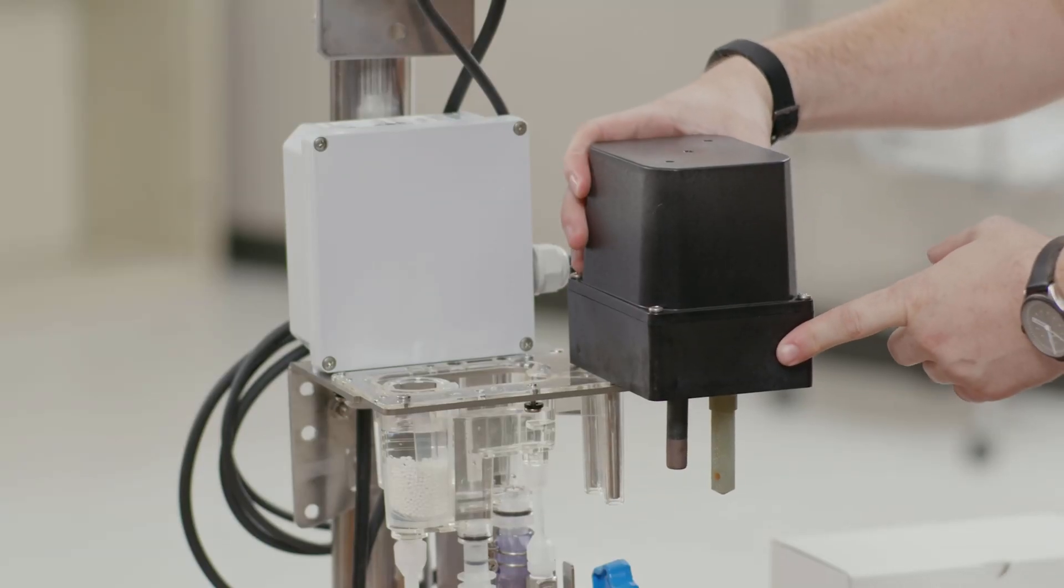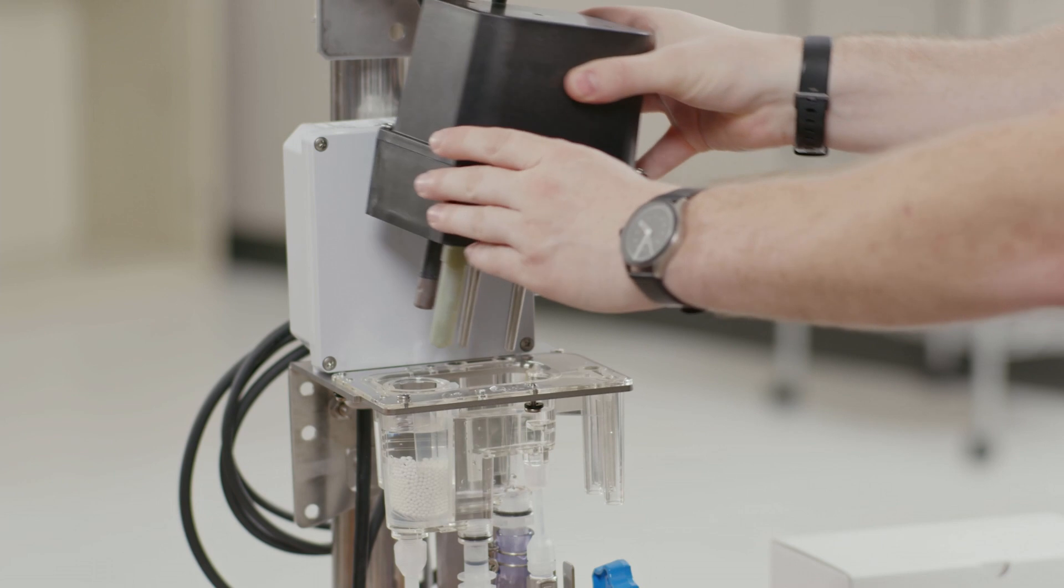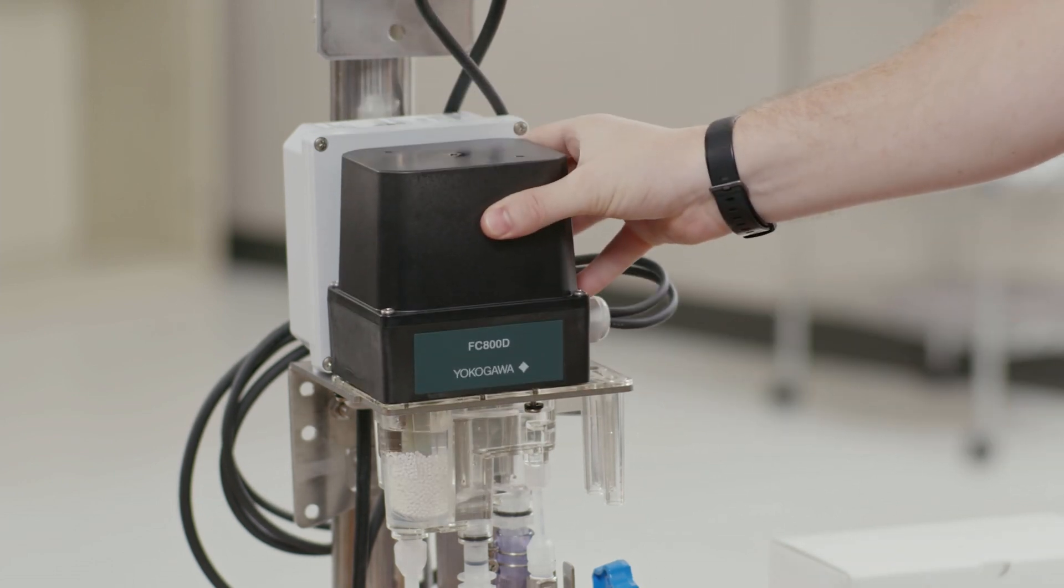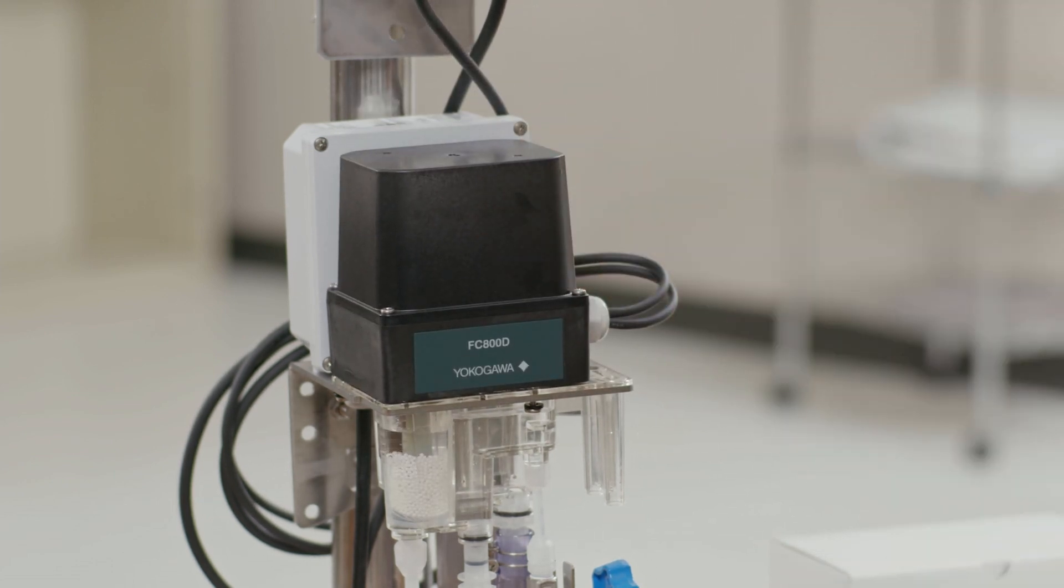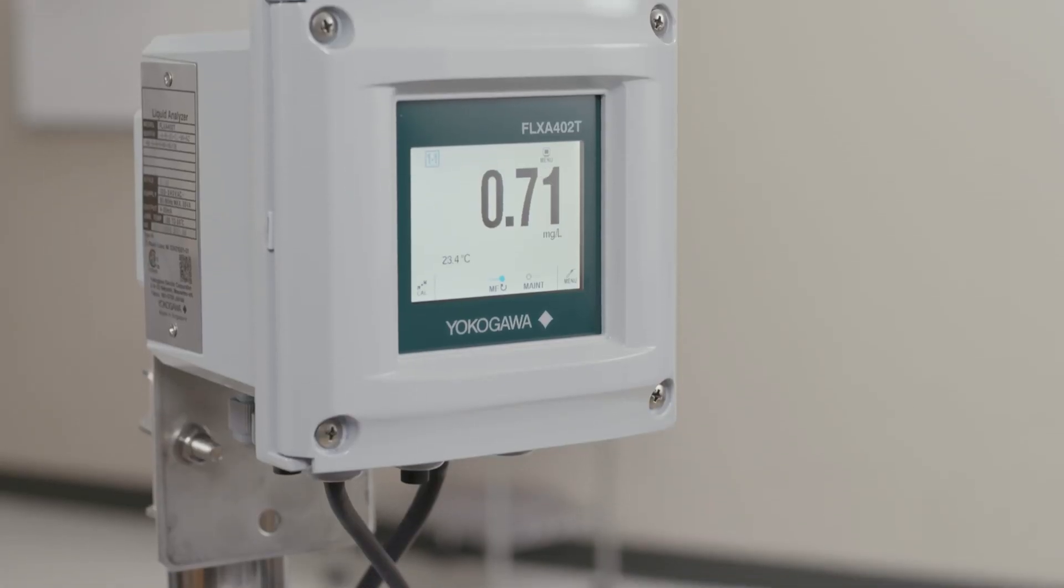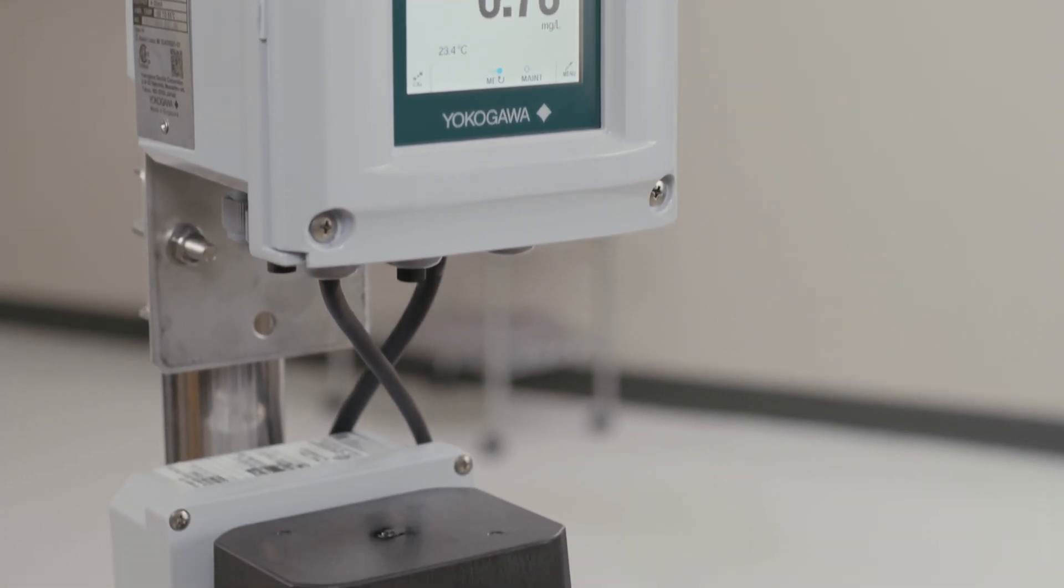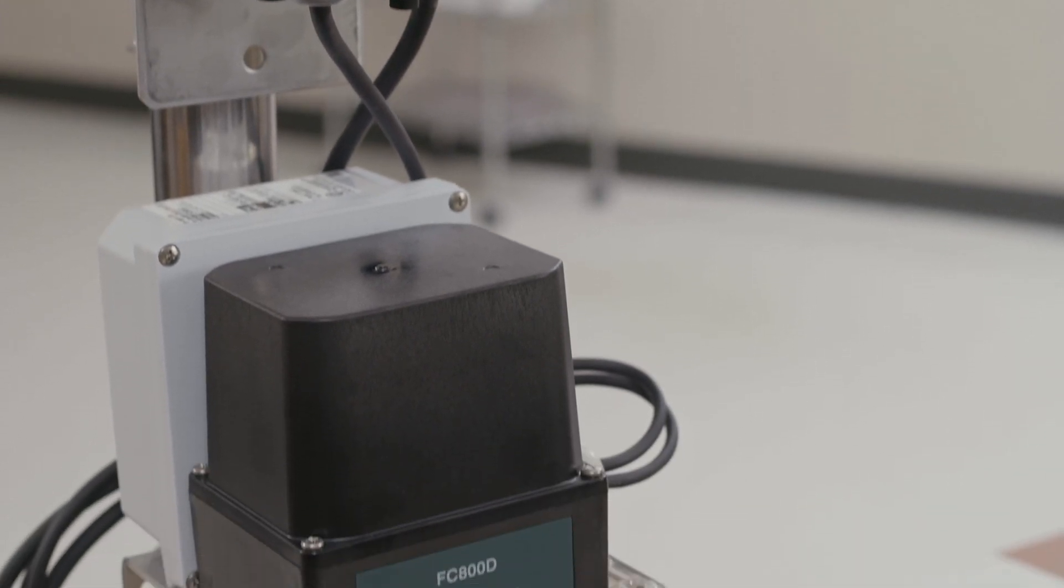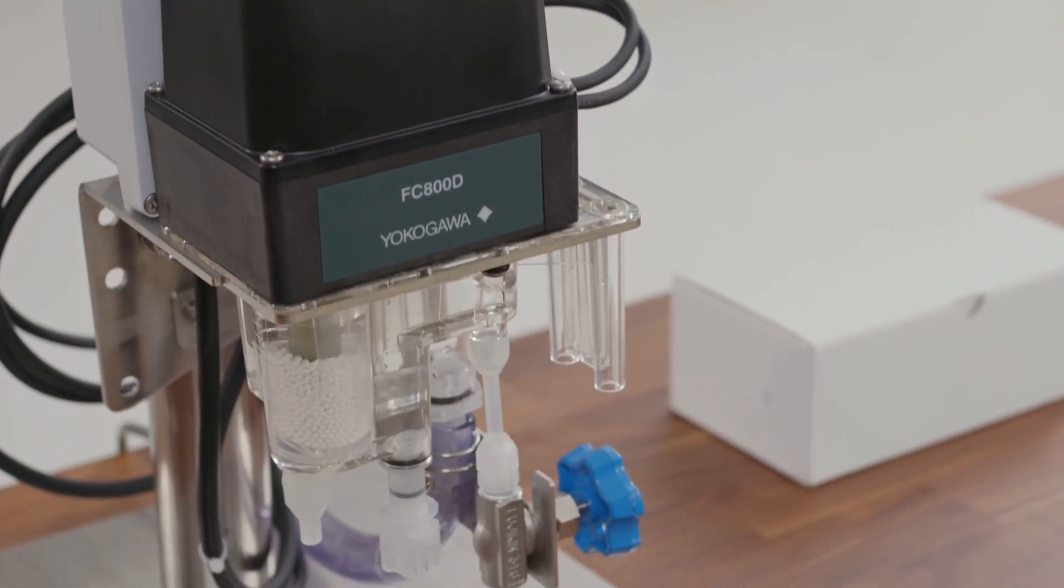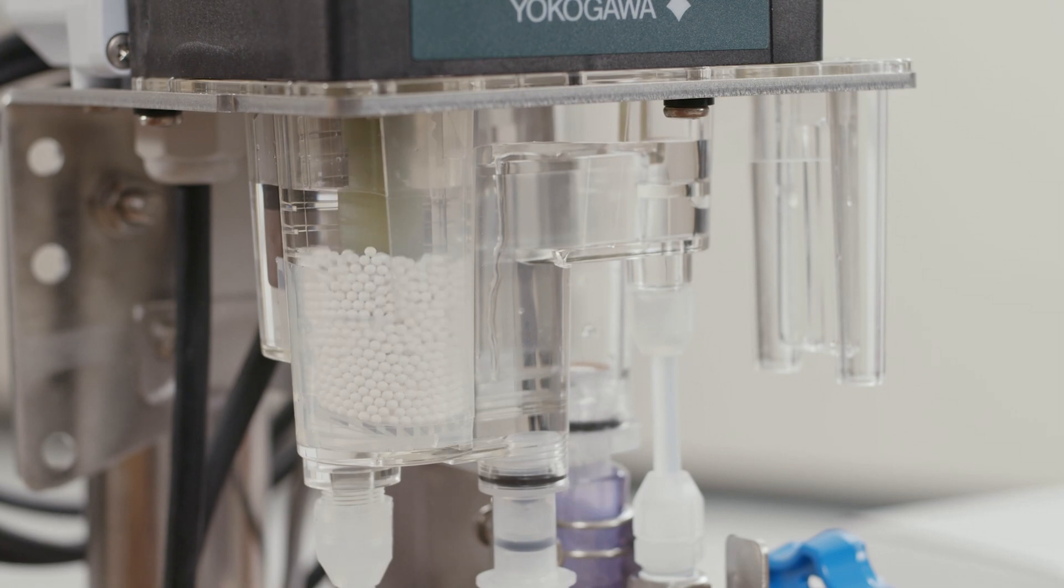Now is a good time to move the measurement assembly from the maintenance position to the measurement position. This will allow you to get your process measurement you need for your span calibration. Now that we've done a zero calibration, we'll move on to the span calibration. The FC-800D uses a process calibration for its span calibration. This uses what your process value is to calibrate your span.